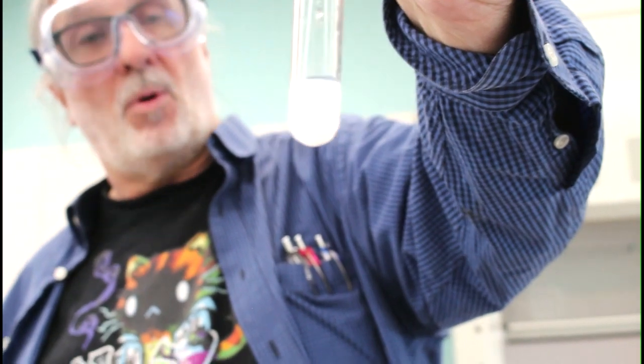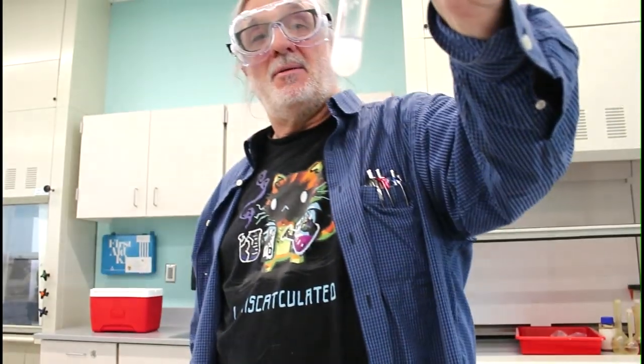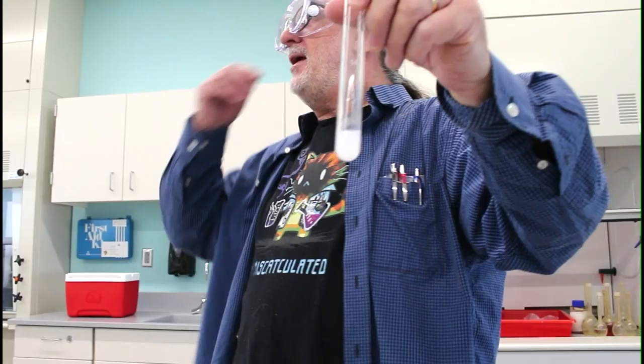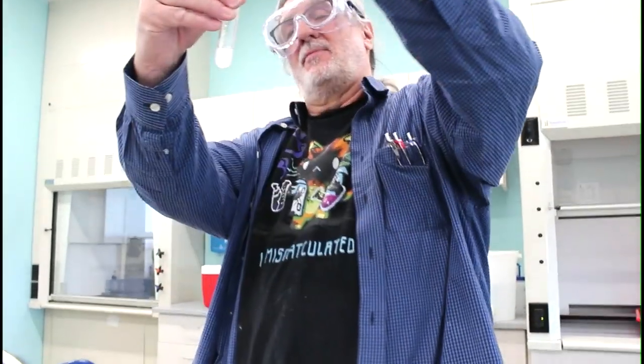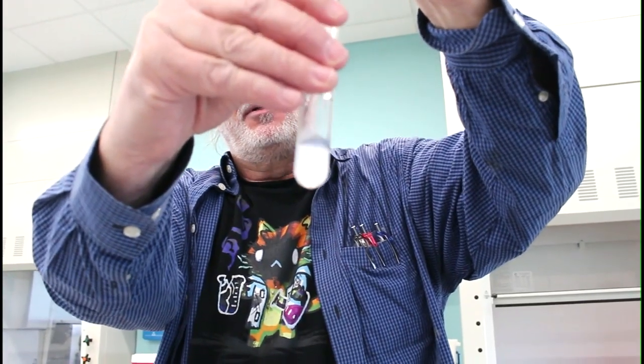Can you see that there's a lot of solid now where there wasn't any before? Why is that? Gosh, I wish I knew. I wish somebody could explain it to me. You know, maybe wishes will come true. We'll see. Okay. All right, and then the next step, it says mix with a stirring rod. You can see again, there's a lot of solid in there.